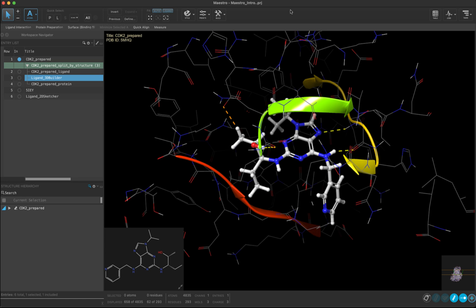The structure hierarchy is useful for diving into whatever structures you have included in your workspace on a more granular level. For instance, you can quickly locate a particular residue or ligand, as well as control how things are rendered in the workspace.